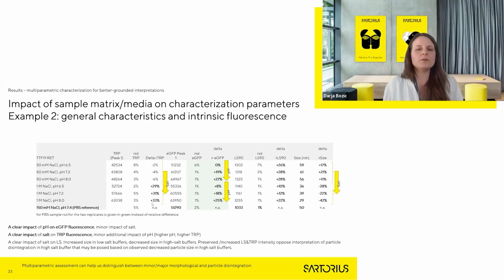Also, if we look at the fluorescence in this particular case, we can see that it did not change the fluorescence of the particles. So it appears that all the particles that were there are still there. So really, connecting different parameters is crucial to draw better grounded conclusions.